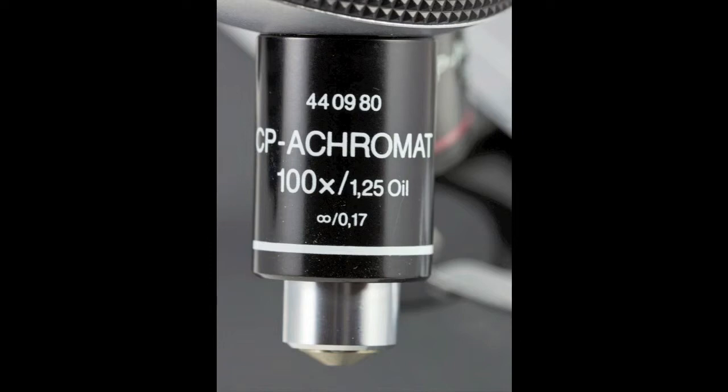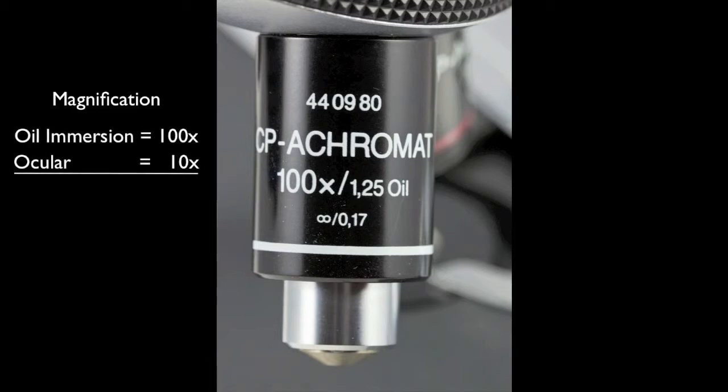The last and most powerful objective lens is the oil immersion lens. This objective magnifies objects 100 times. The ocular magnifies the image 10 times for a total magnification of 1000x.